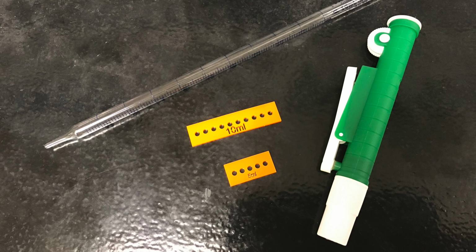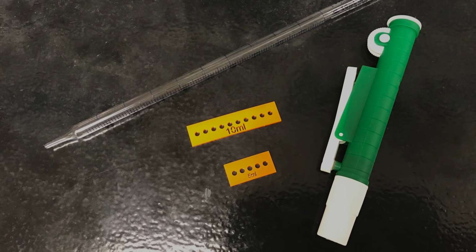While this volume was for 10 milliliters, you could make rectangles for any volume. I also made a smaller rectangle for 5 ml. Both of these rectangles are engraved in print, 10 ml or 5 ml, and have holes drilled into them corresponding to the number of milliliters. So 10 ml has 10 holes and 5 ml has 5 holes.